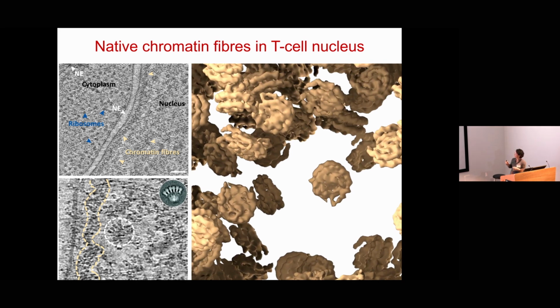Now, this is very challenging to push it further. We add more particles and couldn't get it even better. I believe the nucleosome there is highly dynamic, highly heterogeneous, and binds many chromatin modification factors. So this is what we get.